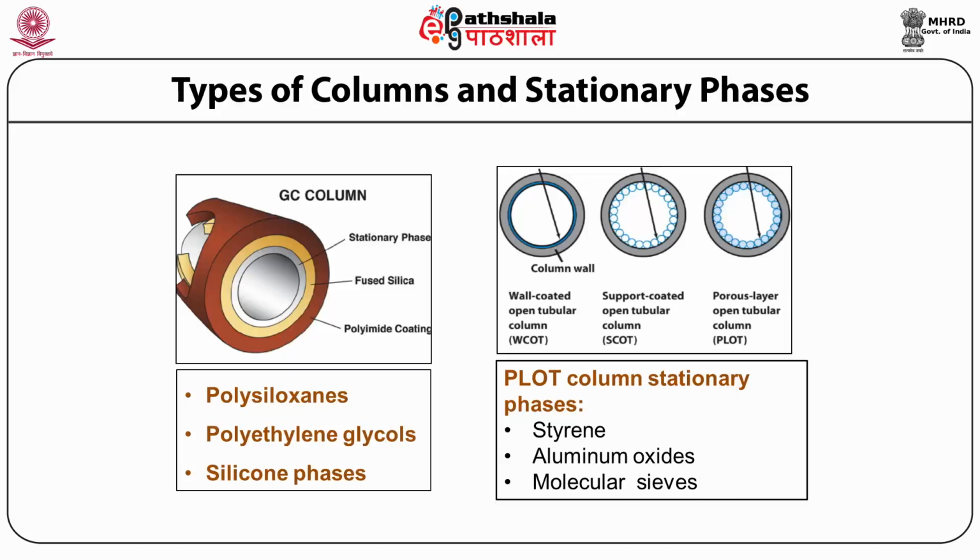Now, the capillary columns, such as the fused silica column, which is a modified W-COT, have much thinner walls than glass capillary tubes. These are strengthened by the polyimide coating that is just shown on the slide, and because of this thinness and their strength, they are flexible and can be wound into coils.